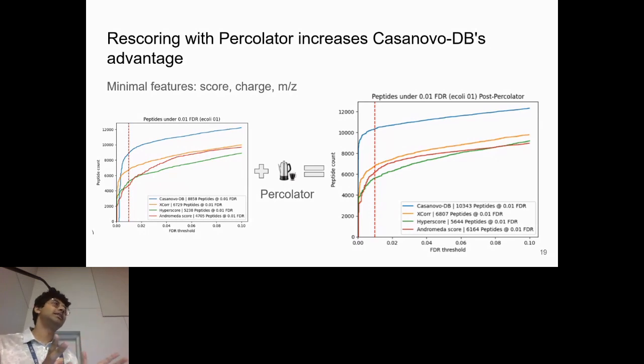I do think it is slower than most methods. Obviously, it uses deep learning, and you need a GPU to run this at the speeds we do. But the model distillation part I was talking about earlier, part of speeding it up is so that we can run it on a CPU with hopefully enough speed that you can run a decently comprehensive analysis. But yeah, feel free to talk to me after. I'd love to think about ways to do that.